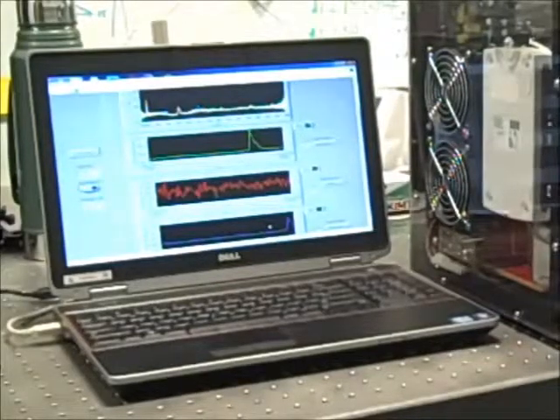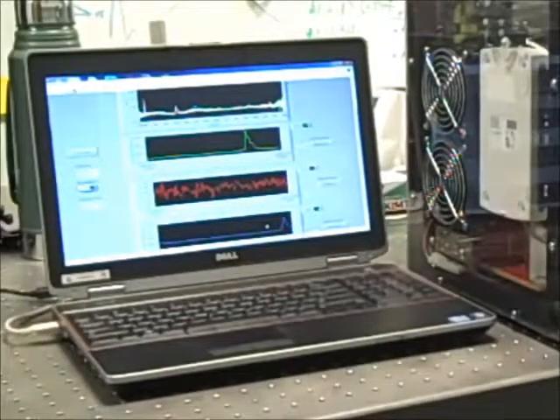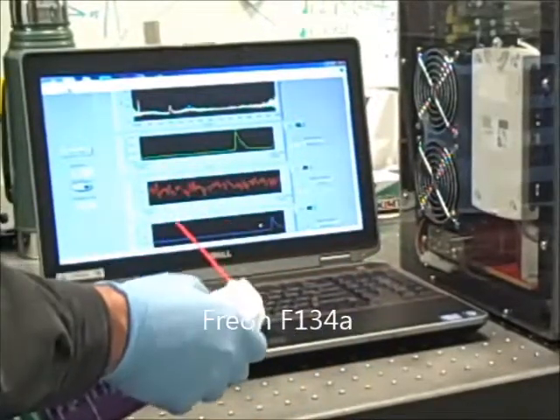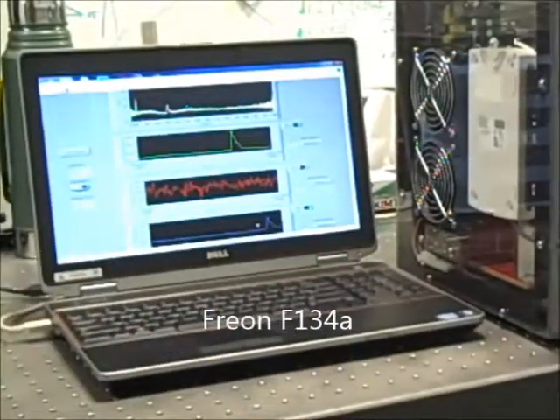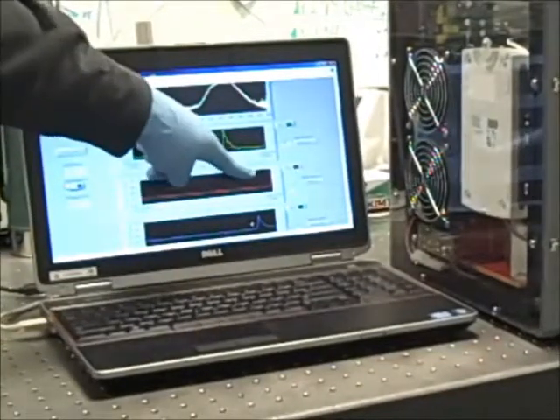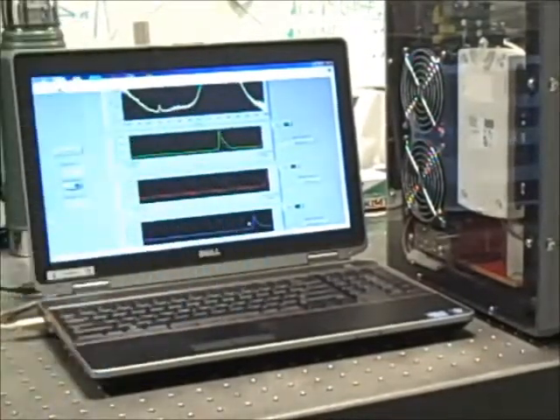For the final demonstration in this video, we use a can duster, which contains Freon F134A. A small squirt directed away is more than sufficient, and the red trace, which is a plot of this Freon concentration, records the momentary peak in this chemical species.